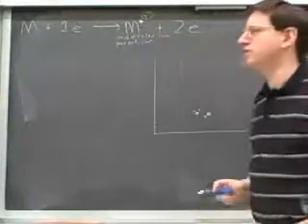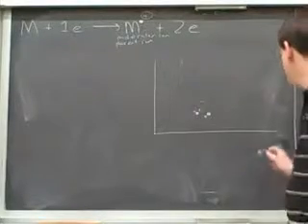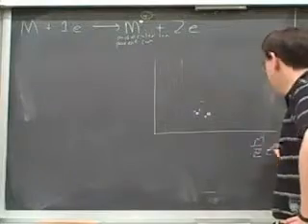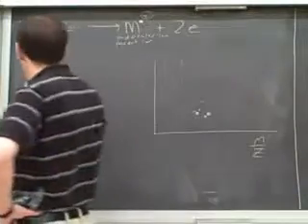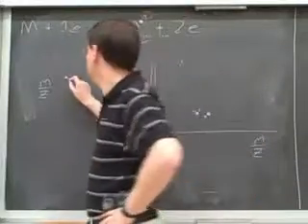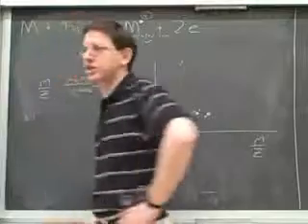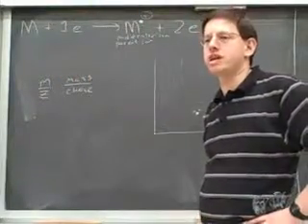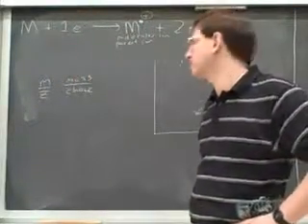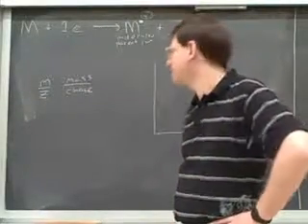Now the apparatus can use adjustments of the magnetic field to determine the M/Z ratio, where M stands for mass and Z stands for charge. We're not going to have time to go through the details, but by adjusting the magnetic field, we can determine what the M/Z ratio is for the particles that go through the apparatus.